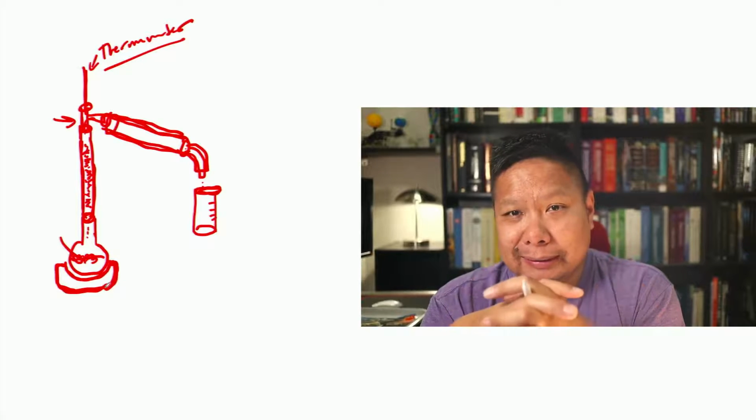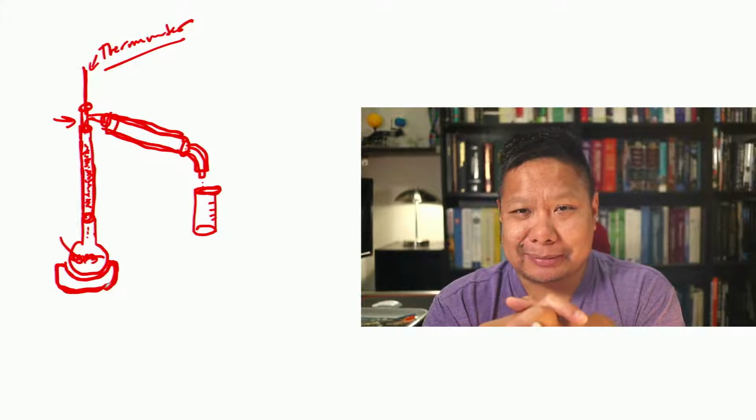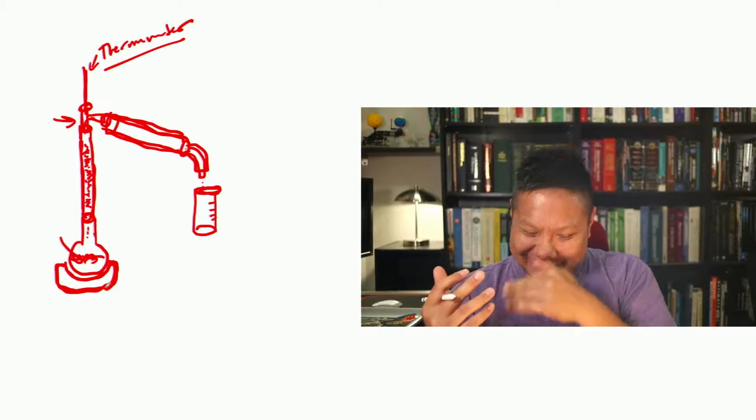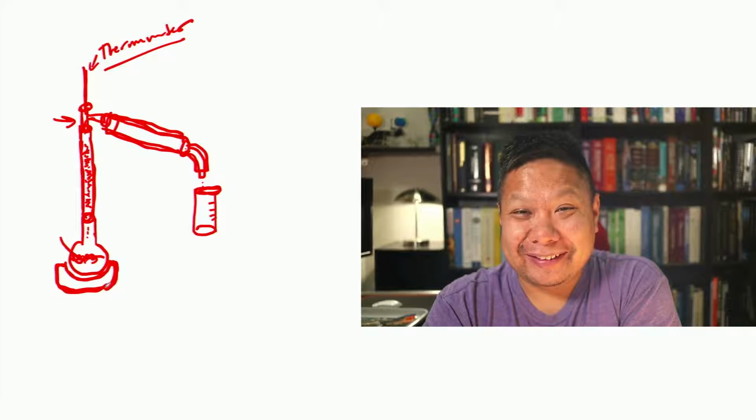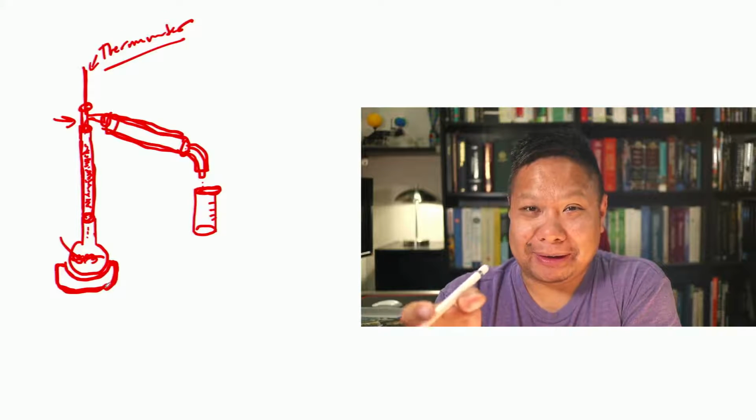Well, I think I mentioned this in one of the previous lectures or pre-lab videos, where we had this method called the white method, and it really has nothing to do with this whole thing here, but this same guy who we coined this method after, he was doing a distillation.